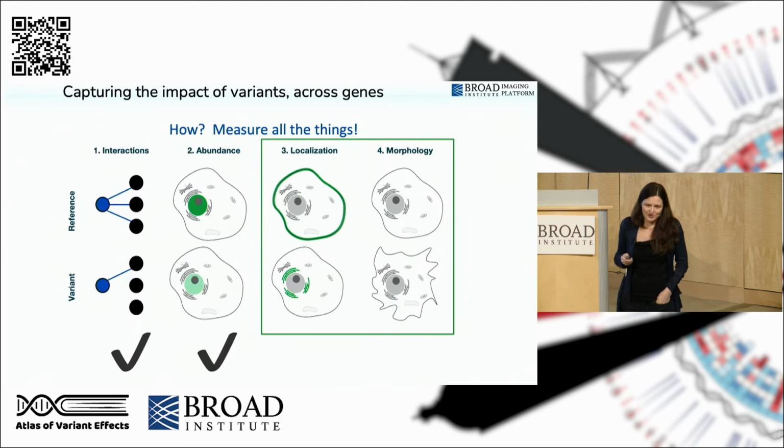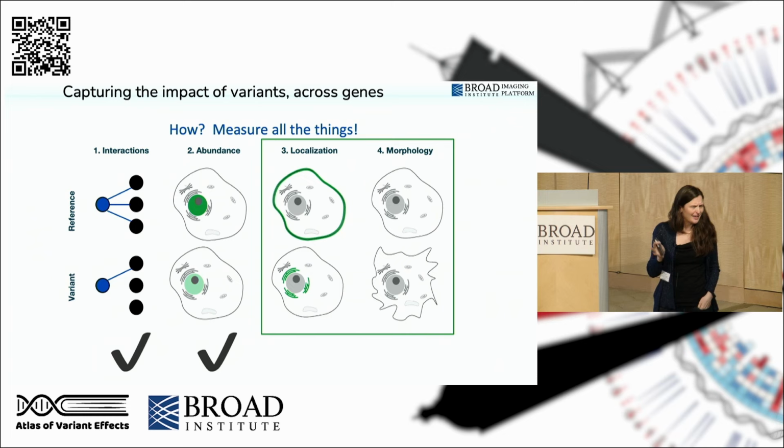All right, so those are those 2 assays, which I know much less about, and I don't know if Mike Calderwood is here. Yep, he's back there, so he'll answer any questions you might have about that sort of data. But now we'll turn to my specialty, which is image-based phenotypic readouts. So we'll talk about 2 of them today, localization and morphology.